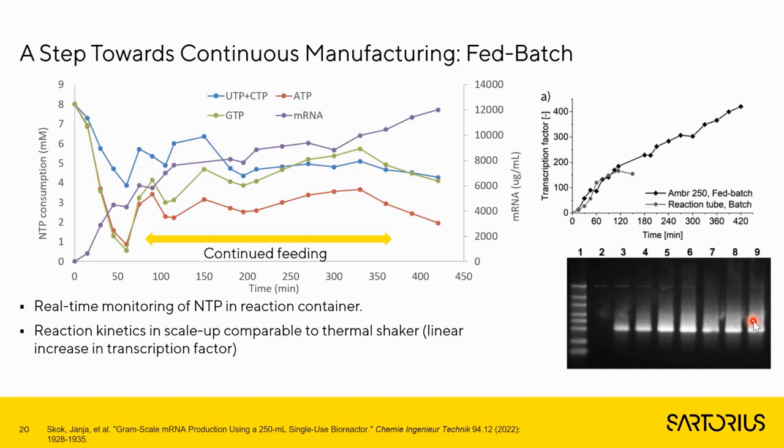So that was one approach towards making a lot of mRNA in relatively short space of time, and also in a small footprint, that was greatly helped by the at-line monitoring based on HPLC using what we call the CIMac PrimaS analytical method. This work is published down here, and again, I invite you to read more if you're interested in this.